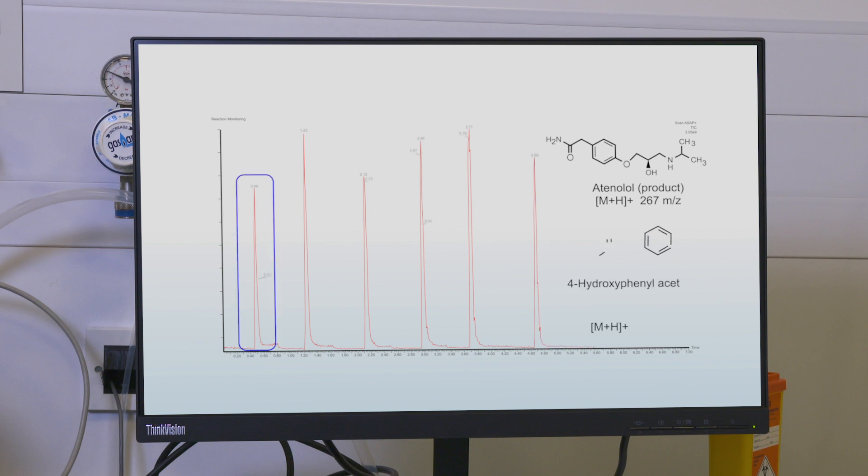Here is an example of the TIC profile. In this case, the mixture containing the beta blocker medication Atenolol and its reaction intermediate 4-hydroxyphenylacetamide.